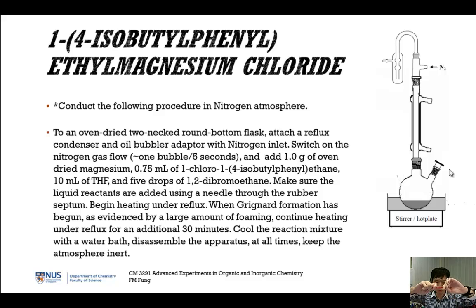How do you open the needle? You uncap it by doing this, okay? Observe the surrounding first. Make sure there's nobody. Okay, this is inside the fume hood. Suppose your hands are inside the fume hood. Then you just make sure you open it. Okay, no recoil. Don't try to control it because some people like to control it and then you get a punctured skin. Not funny. You say, ouch.